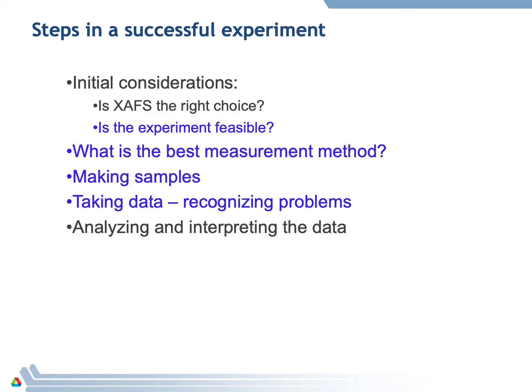The other thing is, what is the best measurement method? There's several different ways you can carry out XAFS. We'll discuss that. I'll talk a little bit about making samples and also recognizing some of the issues involved in taking the data. I won't be discussing how to analyze and interpret the data, which is going to be the subject of several other talks in this course.